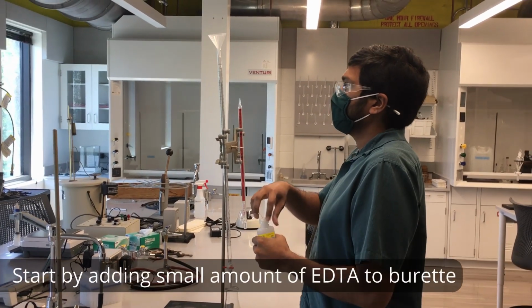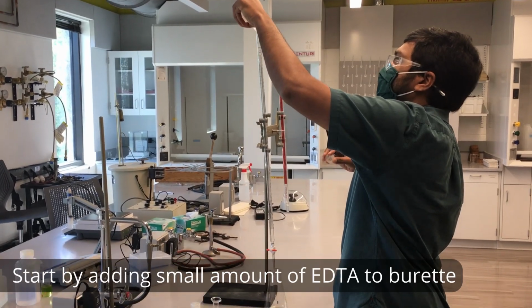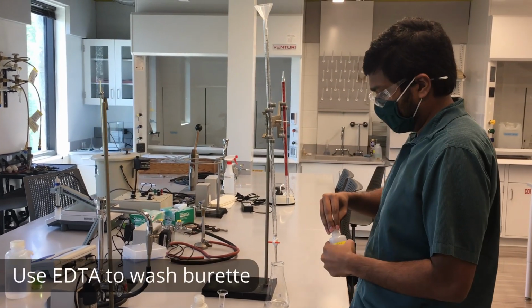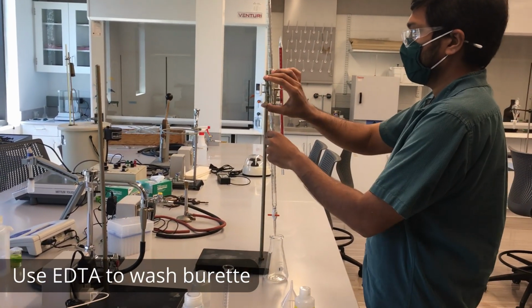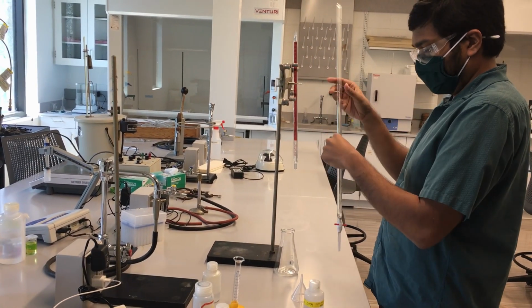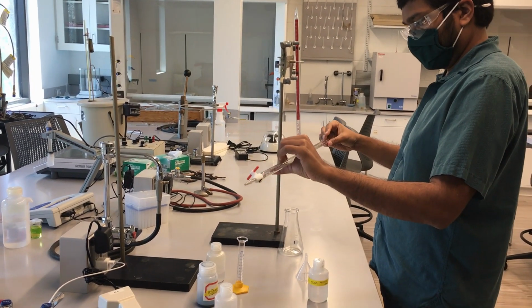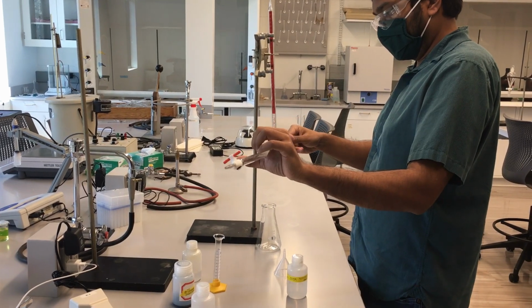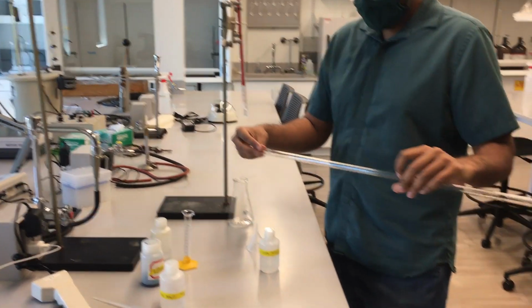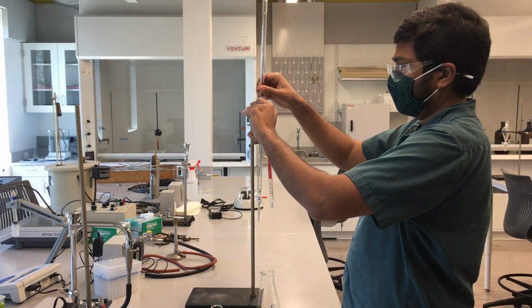So to start off, I'm going to add a little bit of EDTA to our burette here, and then I'm going to go ahead and wash it. Now what that does is it coats the inside of this burette with a little bit of our EDTA solution, ensuring that any other chemicals that are there are washed away. This also prepares the burette for our full EDTA solution and reduces the chance of contamination.